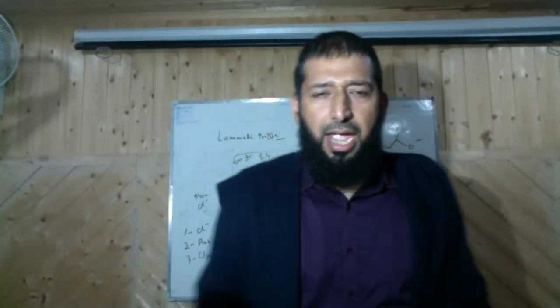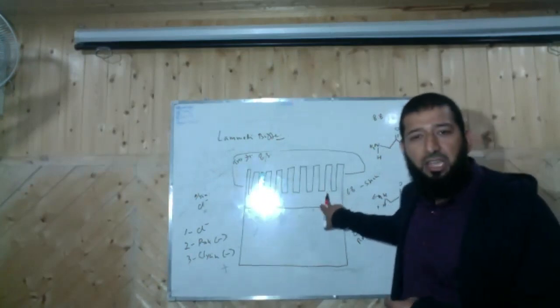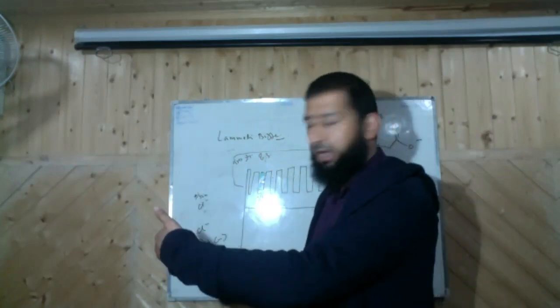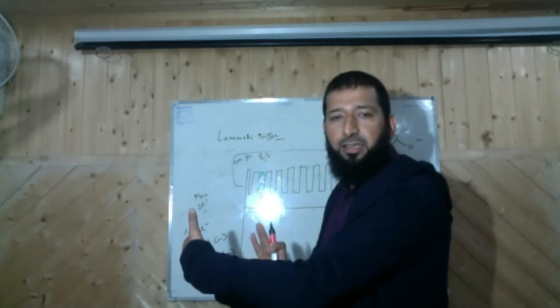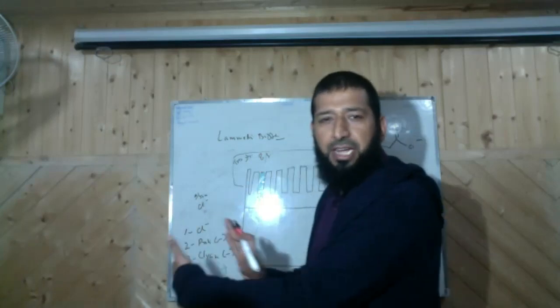Okay, and some people you say, okay, now you run. So that's a biased race. So that this race is kind of everyone starts equally, we use this stacking gel. So what happens here when the proteins enter here? The chloride ions are at the front, protein molecules are behind chloride ions, and then you have the glycine ions. So the chloride ions and glycine ions sandwich the proteins.